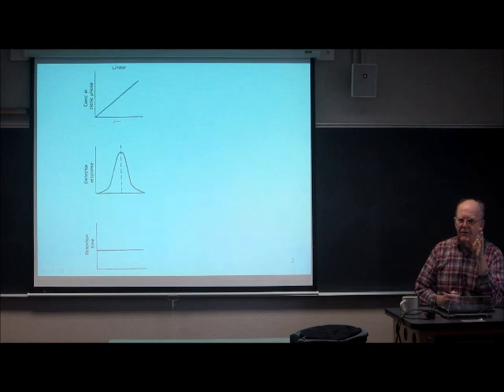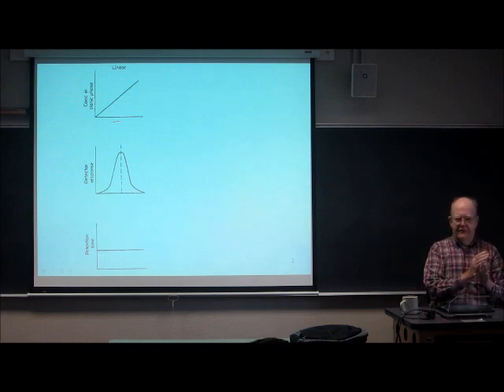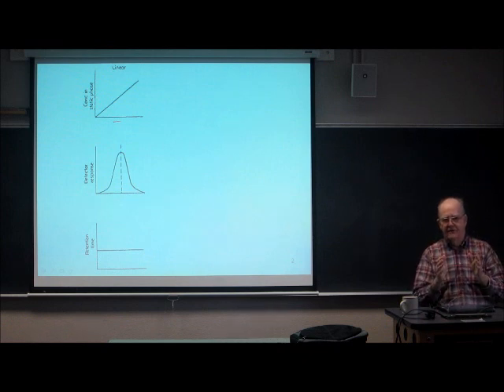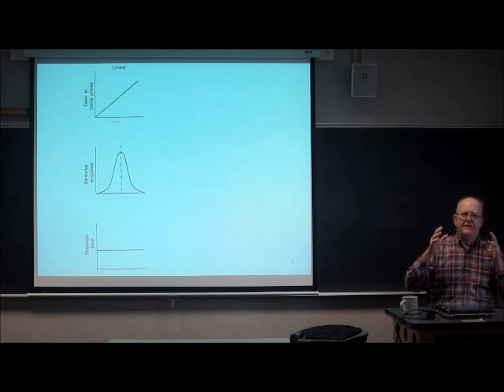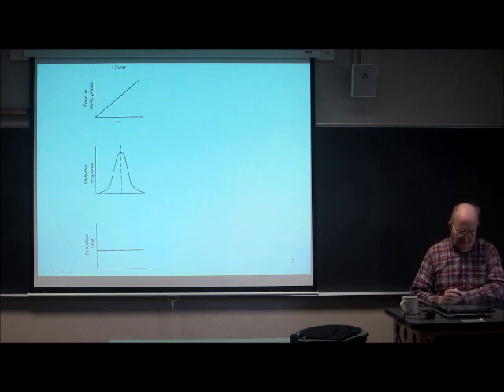We're talking here always now about a small volume. So we're not convolving together two different processes. There's the process of volume overload when you inject an excess of volume into a small column. We're talking about mass overload when there's no more room left in the stationary phase for the solute to behave in a linear region.